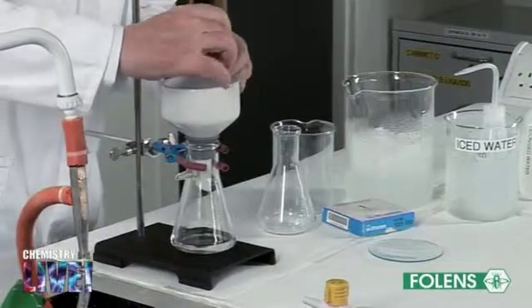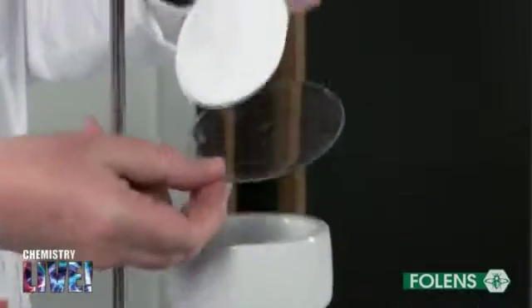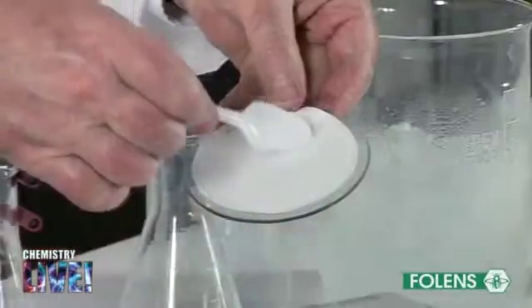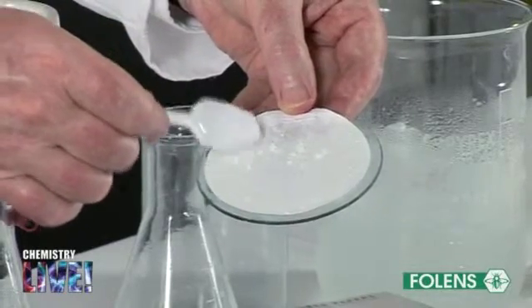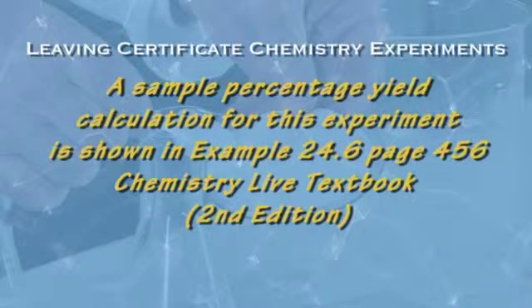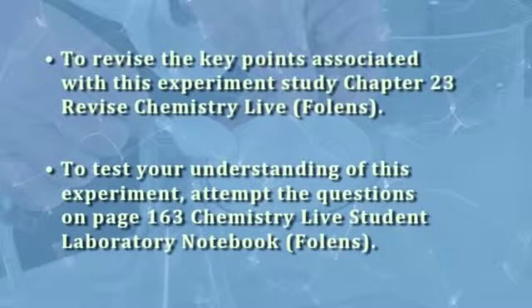Place the damp filter paper containing the crystals on a clock glass and allow the crystals to dry overnight. When the crystals have dried, use the laboratory balance to record the mass of benzoic acid crystals formed. Finally, calculate the percentage yield of benzoic acid as shown in the Chemistry Life textbook. This concludes the experiment.